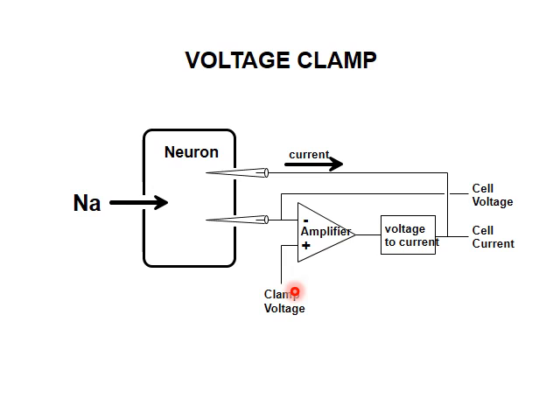Okay, so now at time equals 0 and times beyond that point, we now have clamped the cell to 0 millivolts. Well, things will just remain constant as long as nothing else happens. However, if this neuron expresses voltage-gated sodium channels, we know that when we step the membrane potential of the cell from minus 80 to 0, these channels will open after a very short delay, and sodium ions, positively charged sodium ions, will flow into the cell. This will raise the voltage.